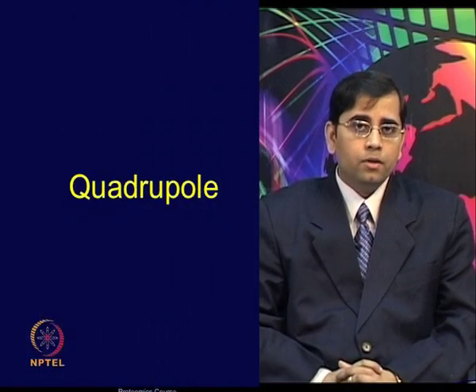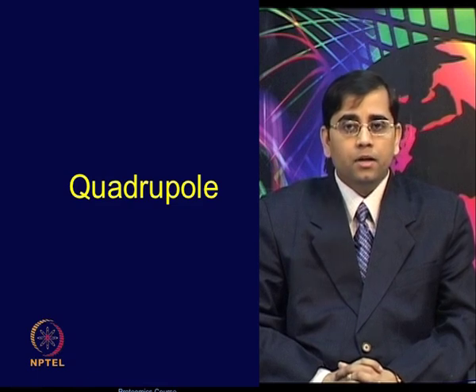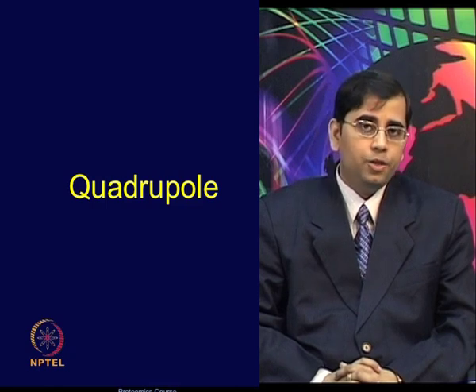Another commonly used mass analyzer is the quadrupole. The Q instruments are one of the most widely used types of mass analyzers currently used in proteomics. It consists of 4 matched parallel metal rods, and mass separation is accomplished by the stable vibratory motion of ions in a high frequency oscillating electric field that is created by applying direct current and radio frequency potentials to these electrodes.